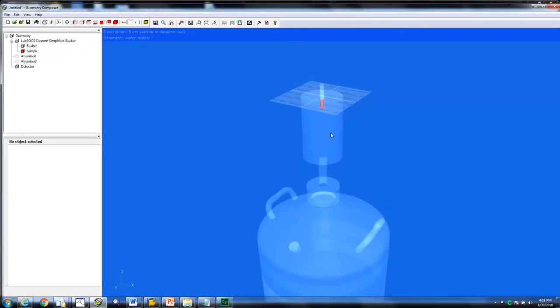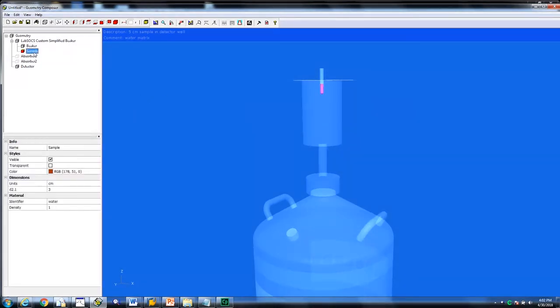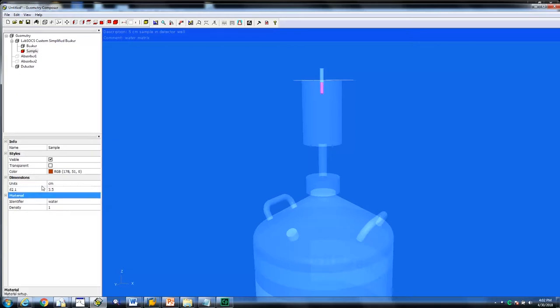The second way to change the fill height of your sample is in the geometry tree. Click on sample. Under dimensions, next to D2.1, you can change the value and hit enter to update. The fill height here is from the bottom of the container up to the value that's been defined.